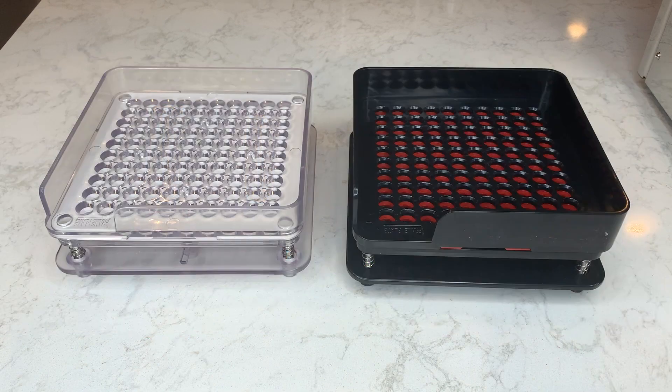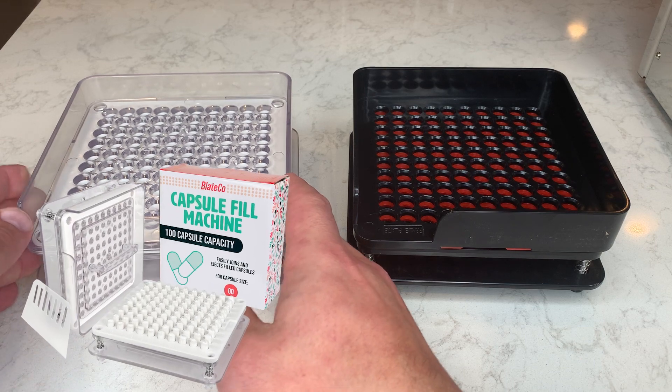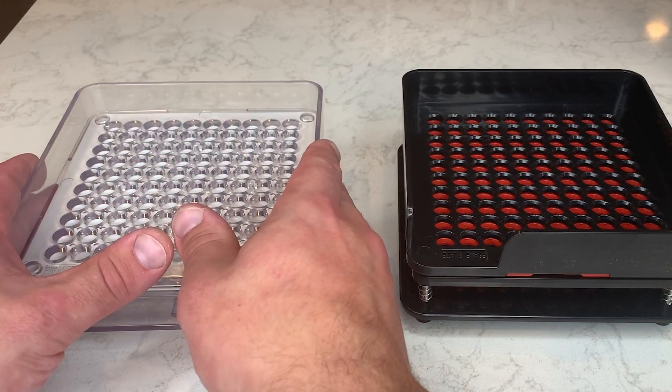This one's our triple zero, which is black and red. And then right here, we have our BlateCo transparent Core Series model. The real difference between these two is obviously that this one has color and this one is transparent.